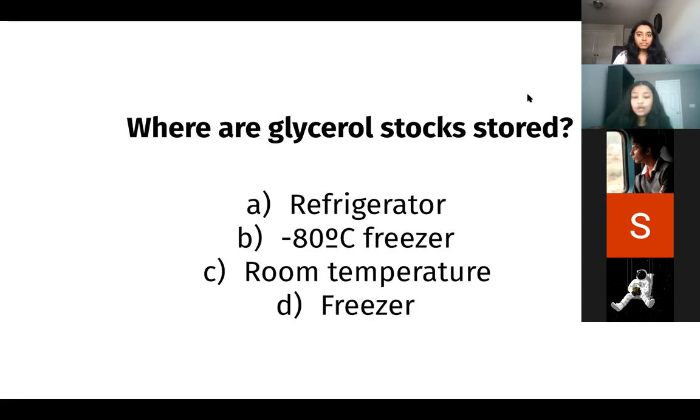Yeah, good job. Okay, yes, it is negative 80 degrees Celsius freezer. And like I said, this is very important. You want to make sure that your glycerol stocks are in there at all times. And if you do need to take it out, make sure you keep it in an ice box or keep it as cold as possible to prevent any degradation of your cells.